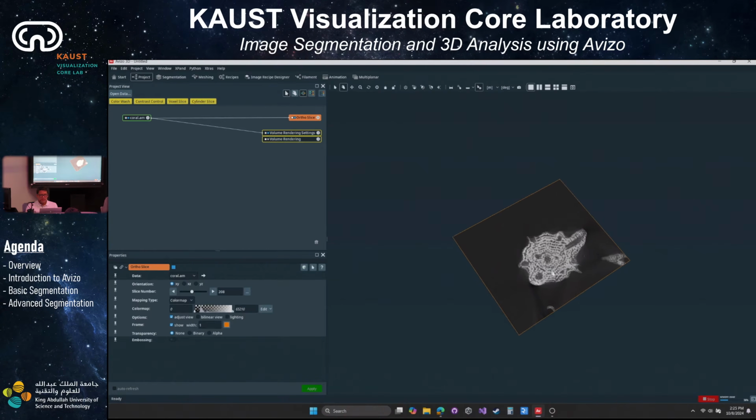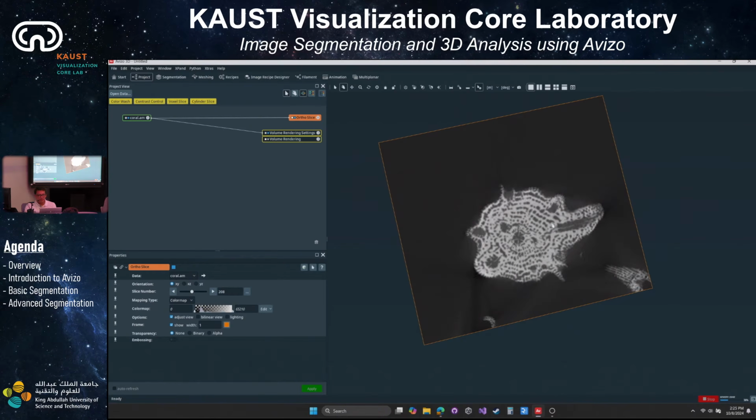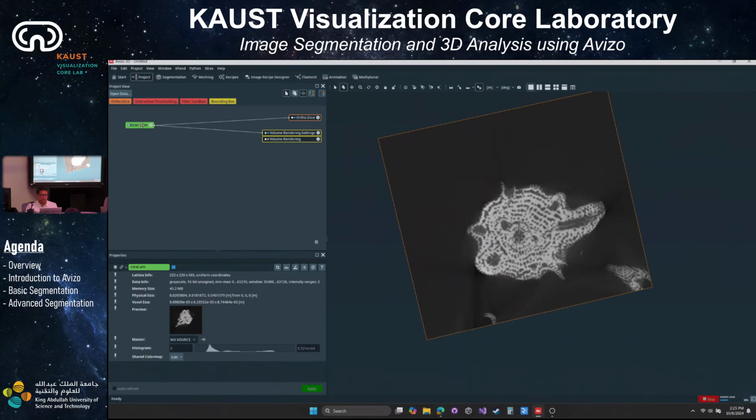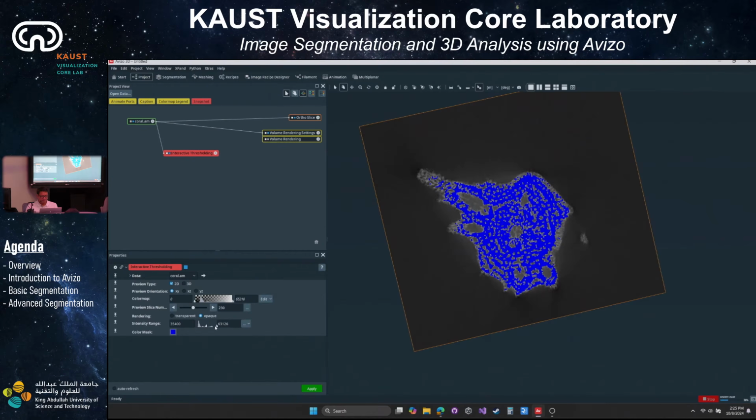So just looking at the slice, right? Again, just from experience, and I guess by now you can tell that just by using thresholding, you can probably get a decent segmentation from this, right? I mean, it's actually super easy to get a preview. So if you just click the coral data again, interactive thresholding, again, it gives you a suggestion, right, for the threshold value. I'm not sure if you can see it here, but there's also kind of a histogram of the data here that can guide your setting of the threshold value.